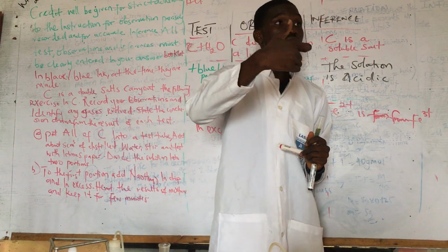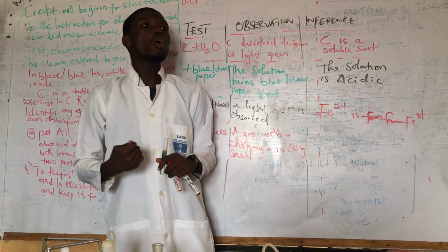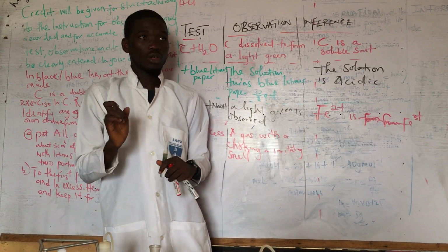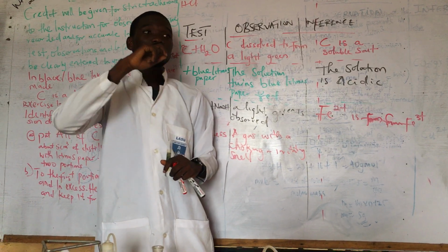or NH3 from NH4. Because when you check my previous video for last year NECO or WAEC, if you have a choking or irritating smell, the inference of that particular gas is what?